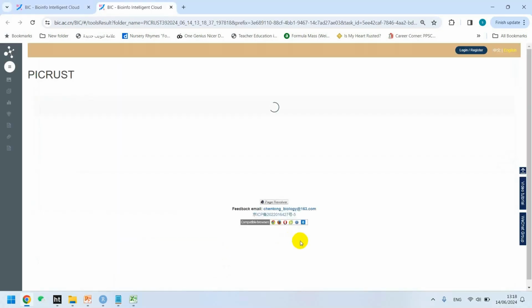When we click submit, it takes some time to finish, and then we will get eventually a list of results generated via this one click. So preferably you can use PICRUST via ImageGP. When it generates some files, then we can download them and save under PICRUST directory, and then we can go back to RStudio and run the commands to proceed, and after that we can use STAMP software to visualize them one by one. It takes some time to get it end, so wait patiently.